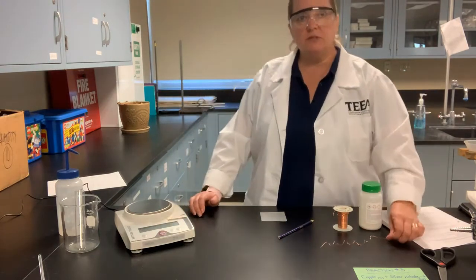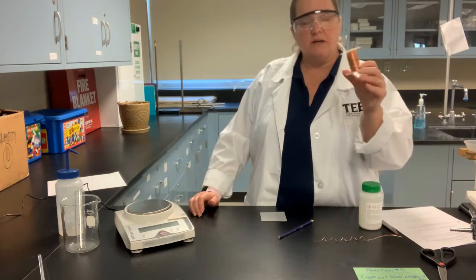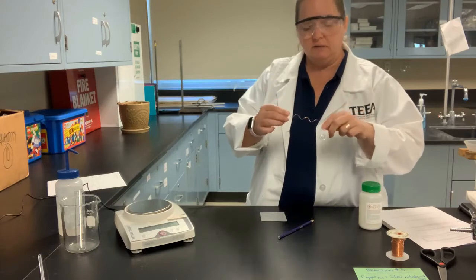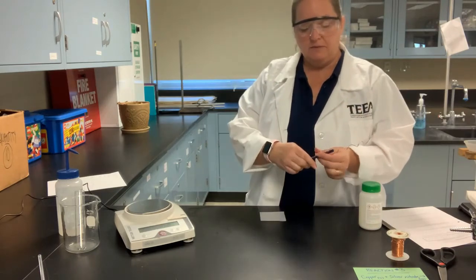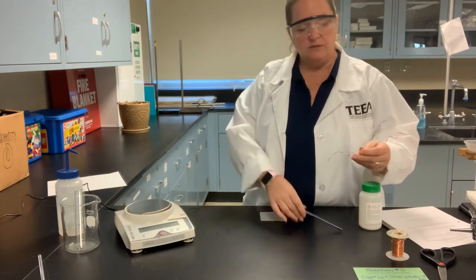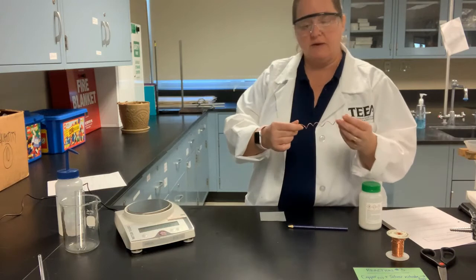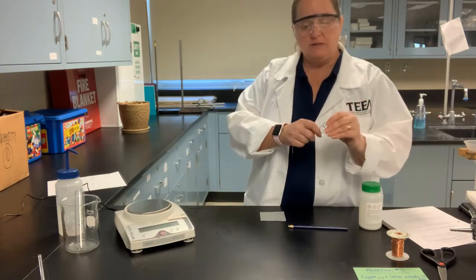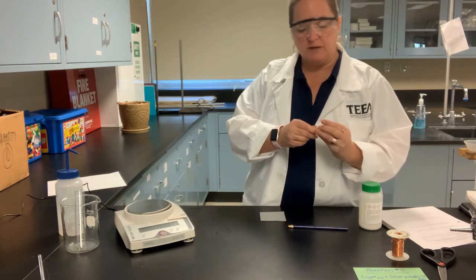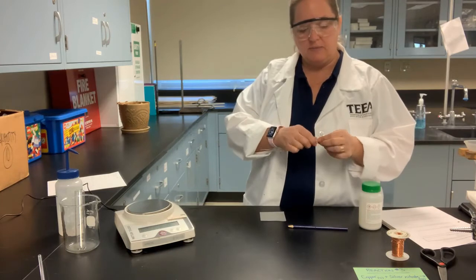And I'm first going to talk a bit about the reactants. This is a simple spool of copper wire, kind of a thicker gauge. And what I've done is I've cut a length of copper wire, and then I've used a pencil to simply wrap the copper wire around to create this spiral pigtail kind of situation. And this is so I can compress and get a lot of surface area of copper wire in my solution once I create my setup.